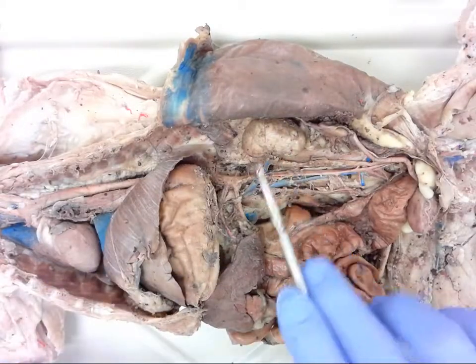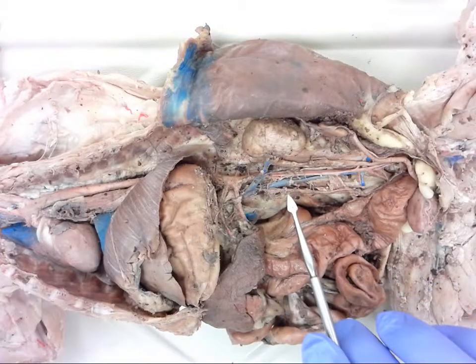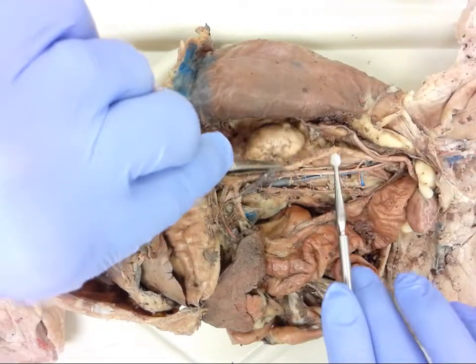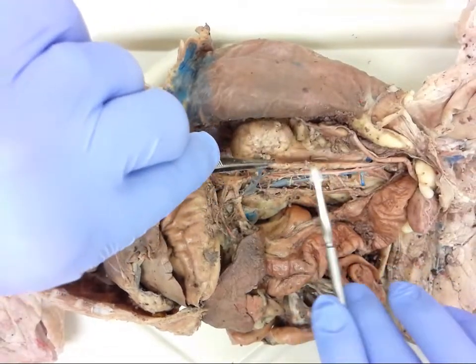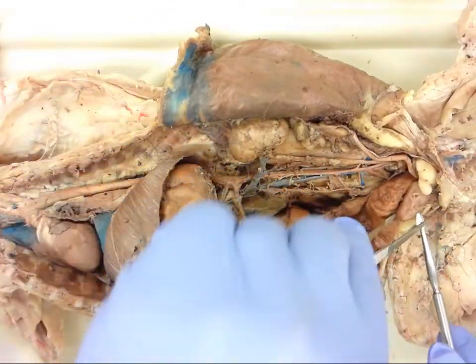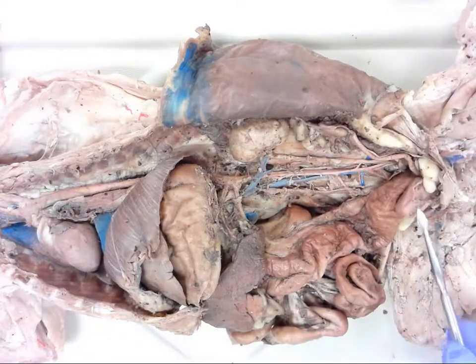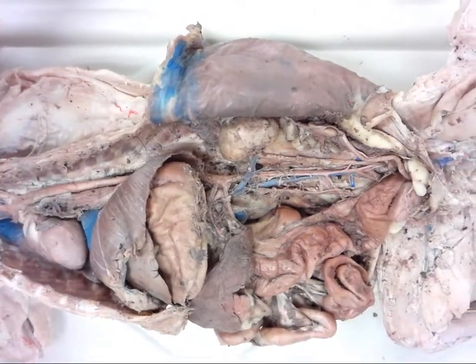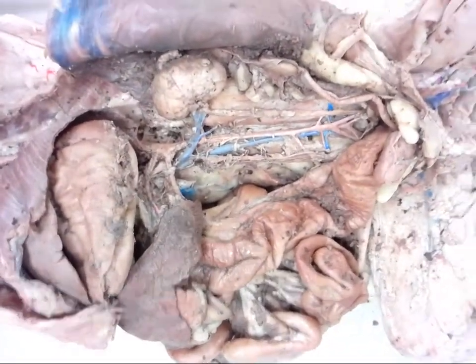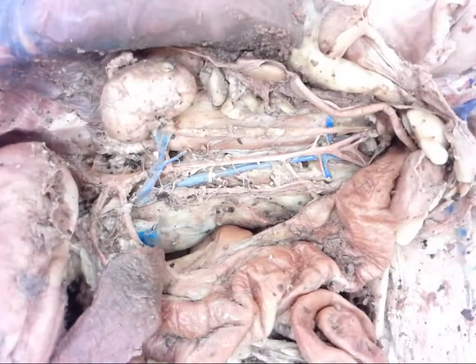Once that blood is filtered, we now have produced urine, and urine is going to pass through the ureter, and the ureter here has been pulled out from the membranes that it was encased in. If you follow it down, it goes down to the bladder, and this cat actually has a fairly small bladder that sits right in front. Okay, and then as we go down a little further, I'm going to zoom in just a little bit, get another view of it as we get through our review here.